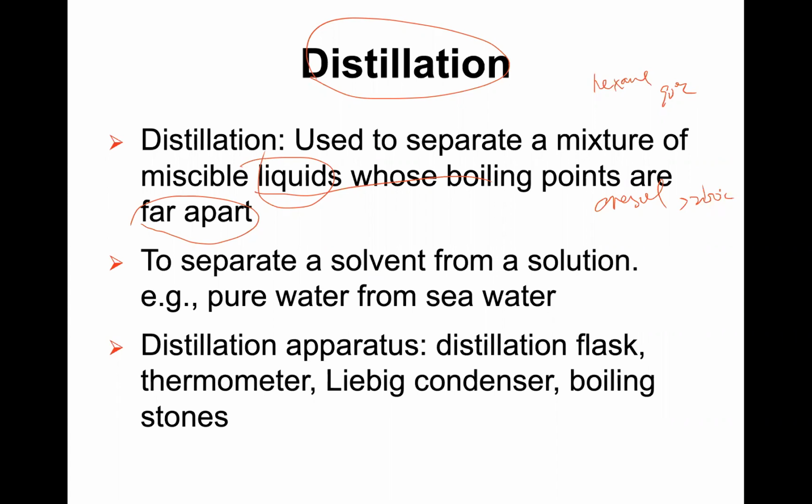We ask that the boiling points be far apart from each other. If they are very close, then they can vaporize at the same time, or go to the vapor pressure, then vapor phase. So you cannot separate them anyway. So that's how we ask for that.